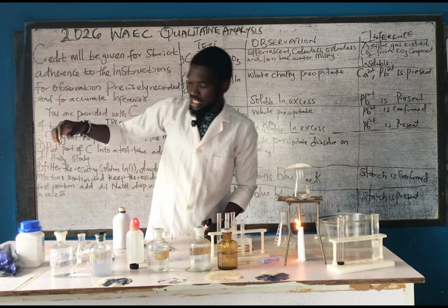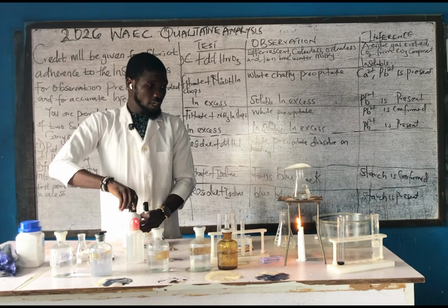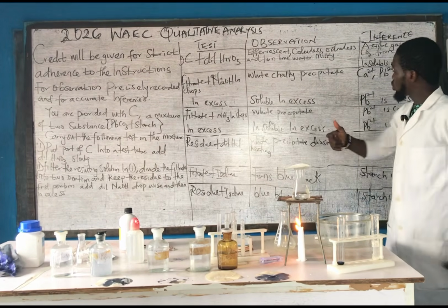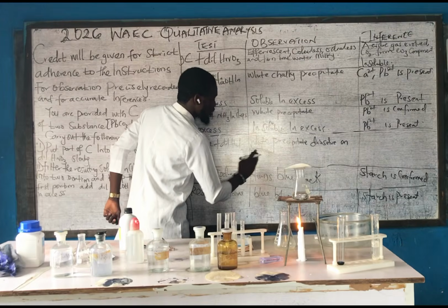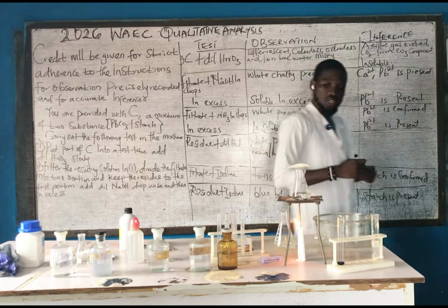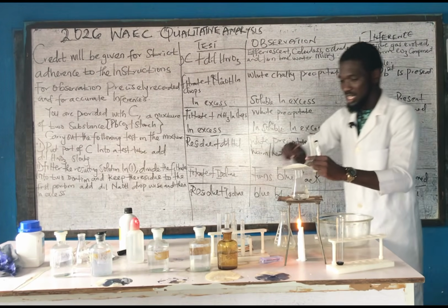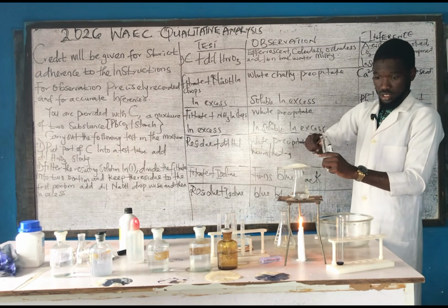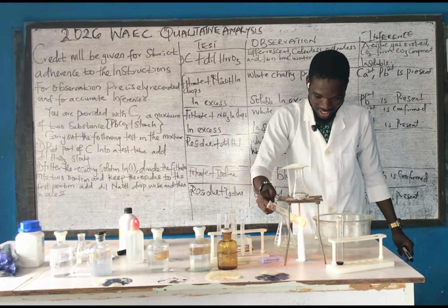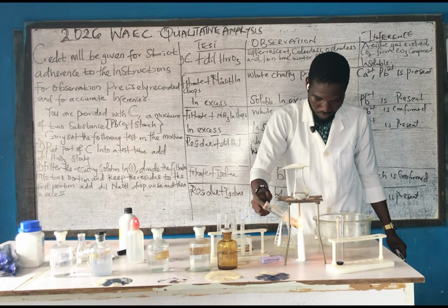So guys, when we talk about qualitative analysis, don't forget, I still want to confirm white precipitate dissolves on heating. Let's use warming, because either you heat it or you warm it. I'm making use of this.